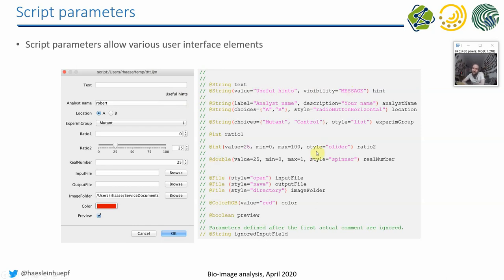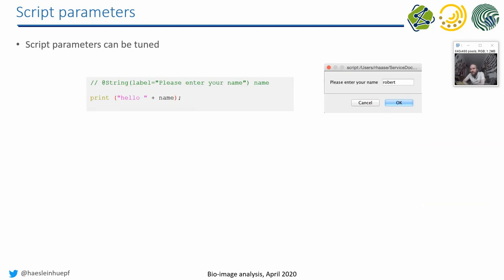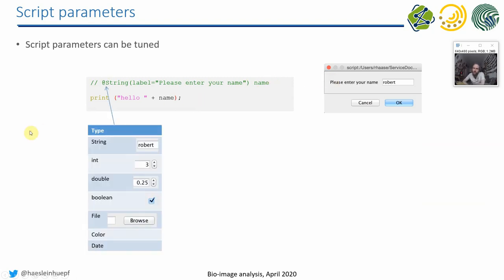And if you change the style, you can actually have sliders and spinners. You have more opportunities of how to configure this. To show this a bit in a more systematic way, that's again such a line. So I have a string here with a certain label, and that's my variable name afterwards. This is how it will look like. And you have certain options for all these things you can enter here.